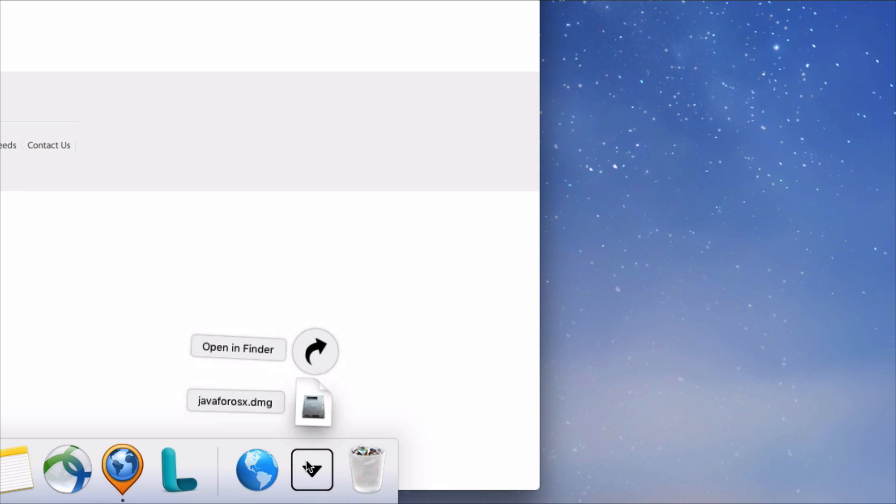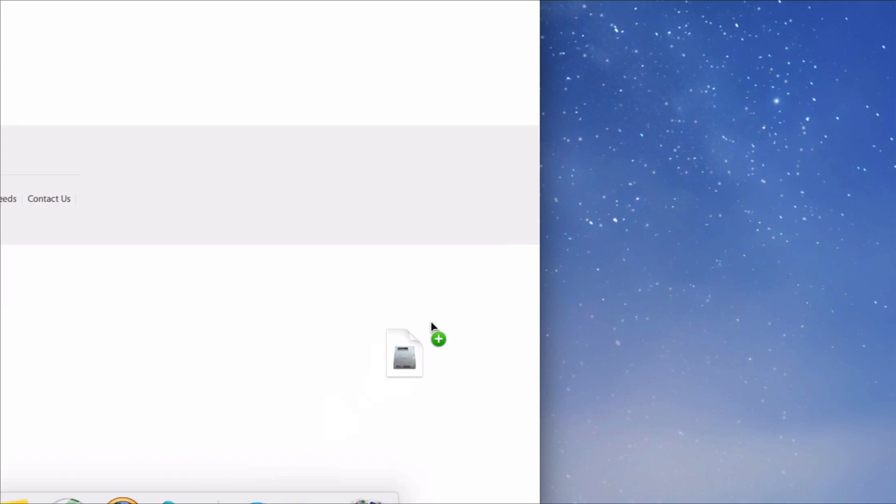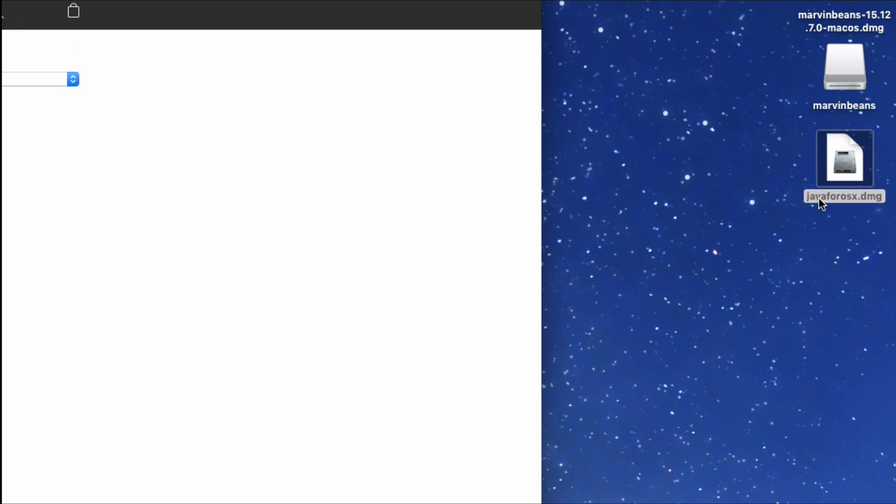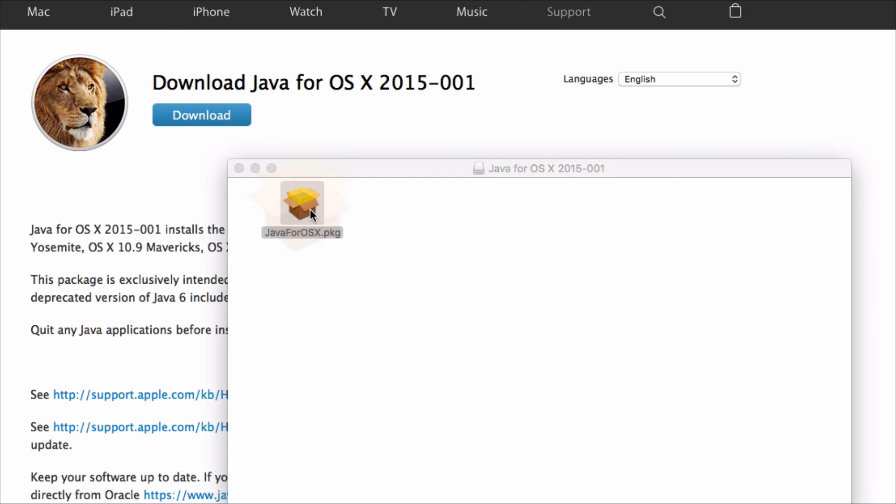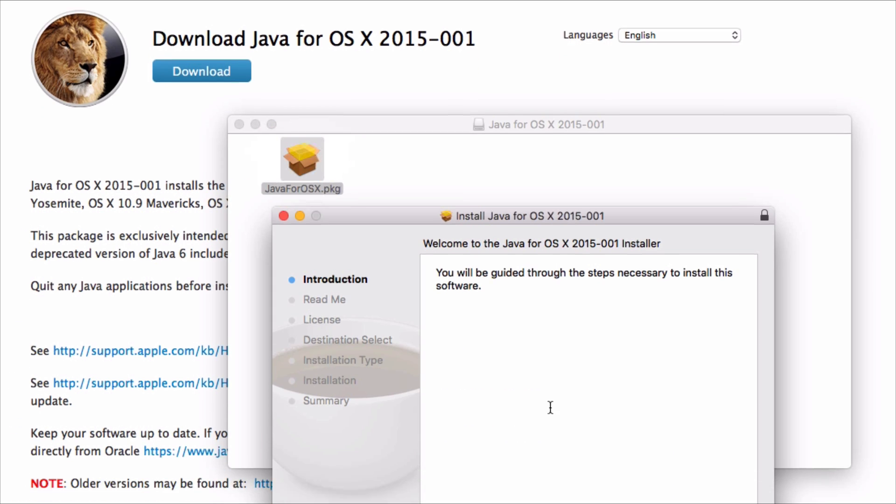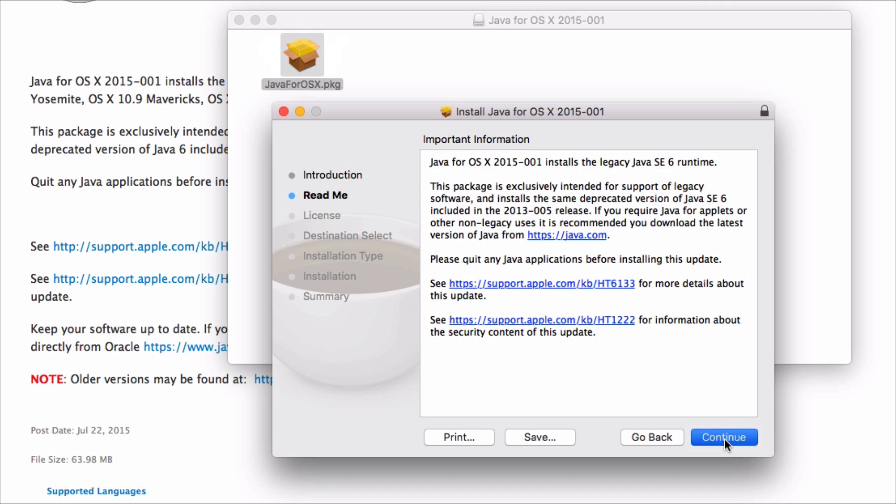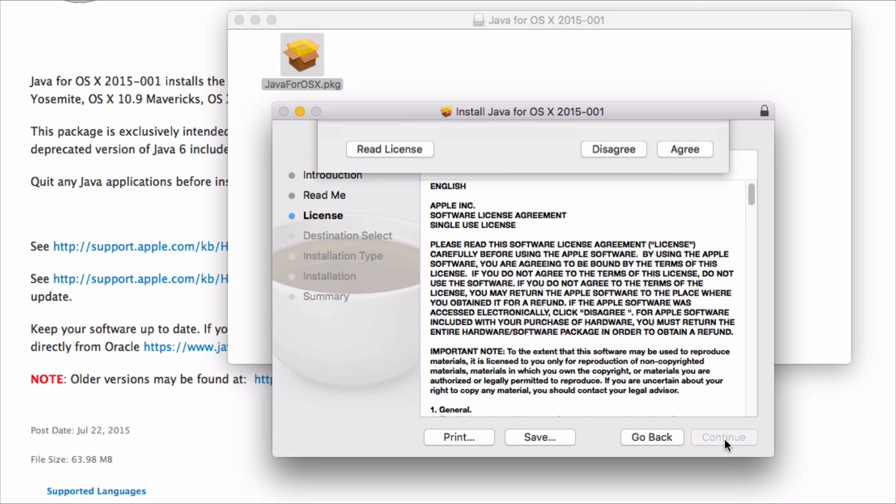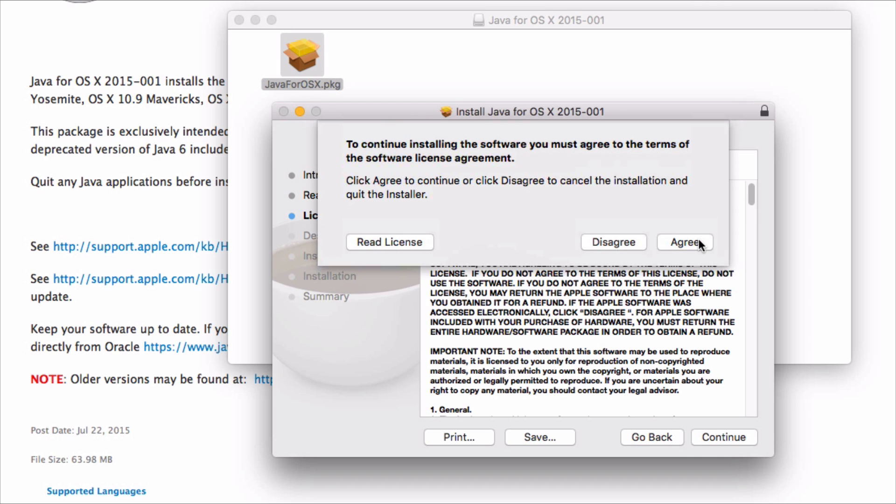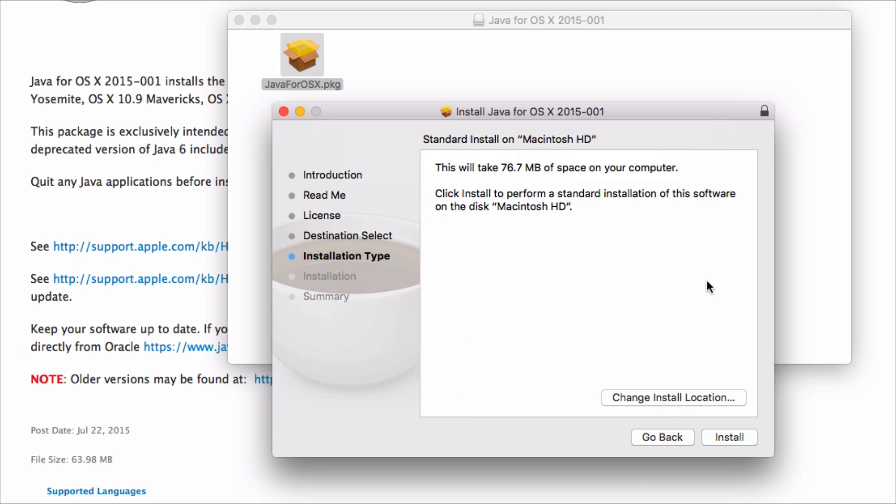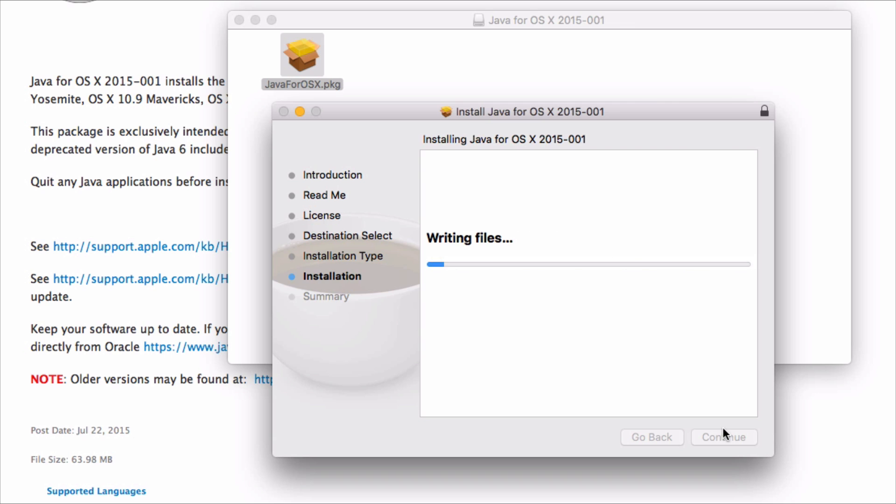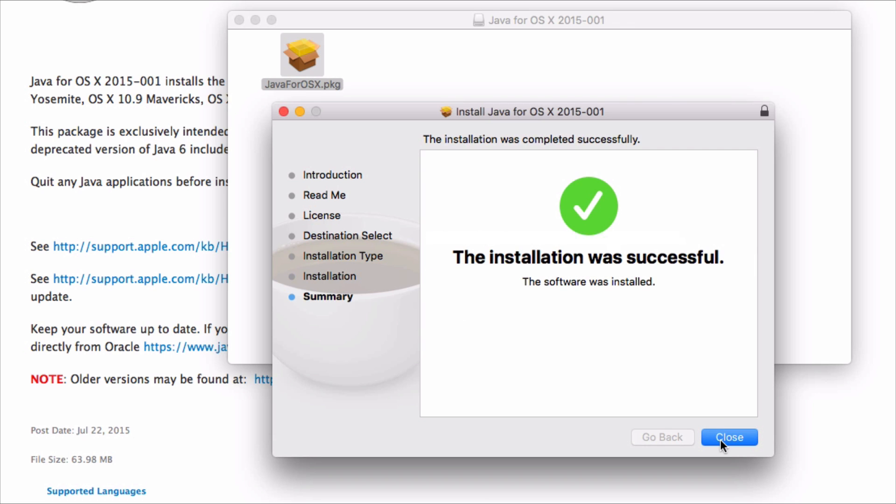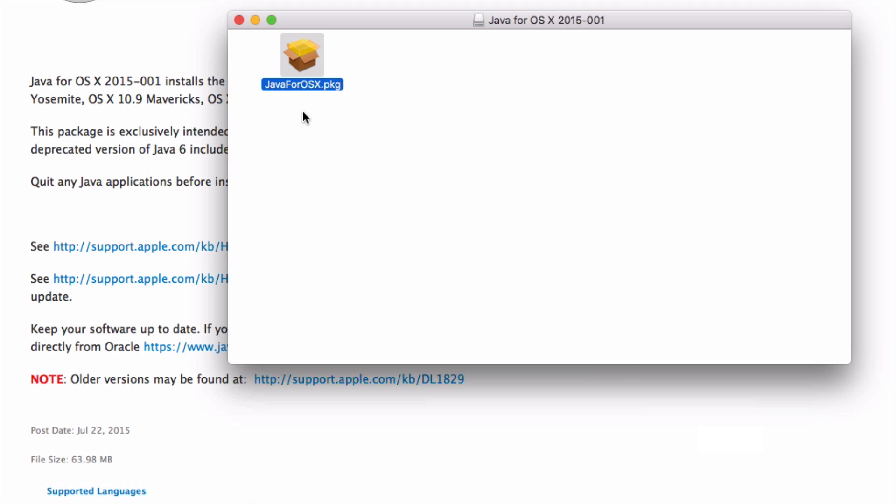I'm placing the Java SE 6 image disk on my desktop. I'm working as fast as I can. Go grab a cup of coffee if you do not need to follow these steps. Now let's get back to installing Marvin.